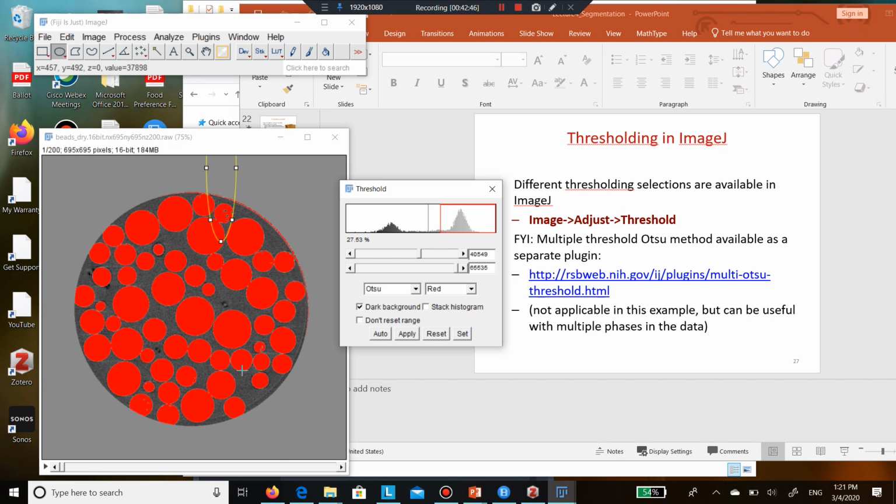Yes. So small things, I'm going to spend one moment on it. Small things do matter. Here, the choice of my background is annoying. It now picked up just a little bit of the outside of that background, pretty much where there's a mismatch between it and that solid boundary.